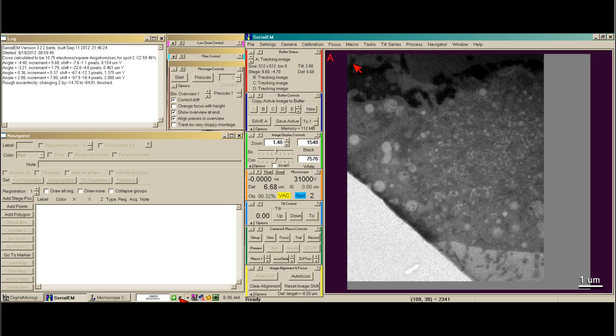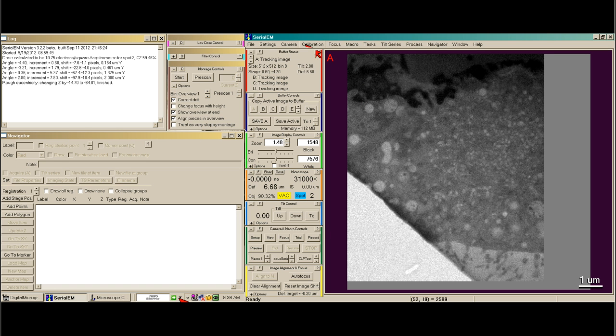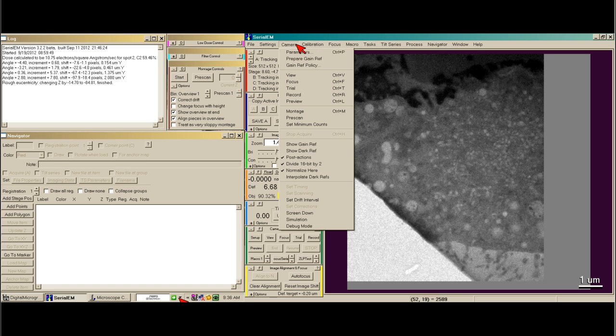I'm going to show you how to take a gain reference using Serial EM. So first, we go to the camera menu and say prepare gain reference.